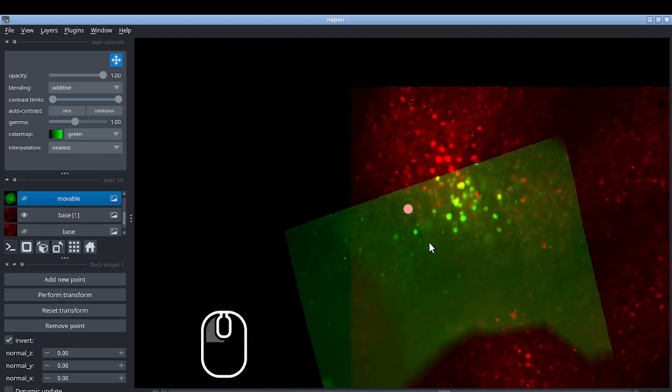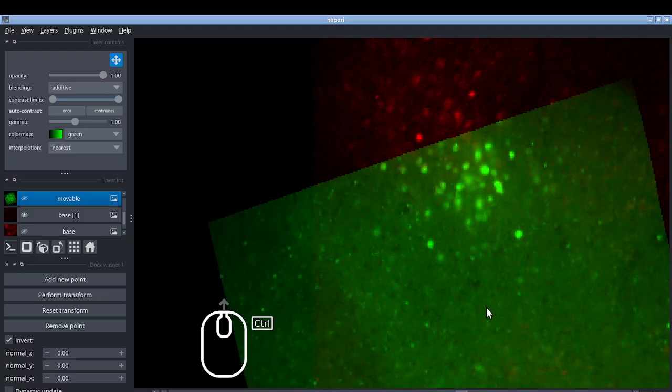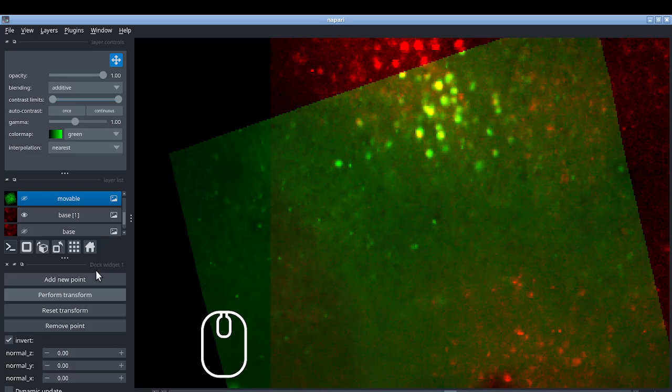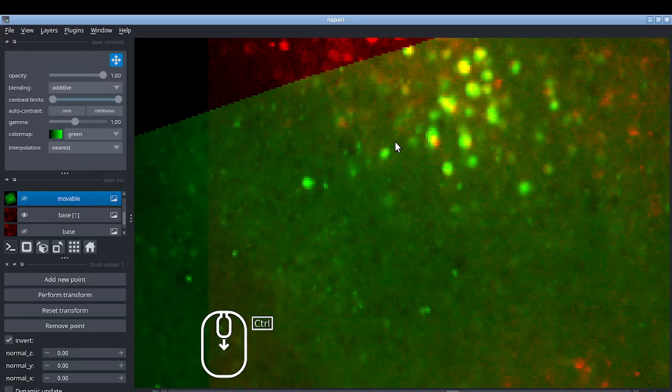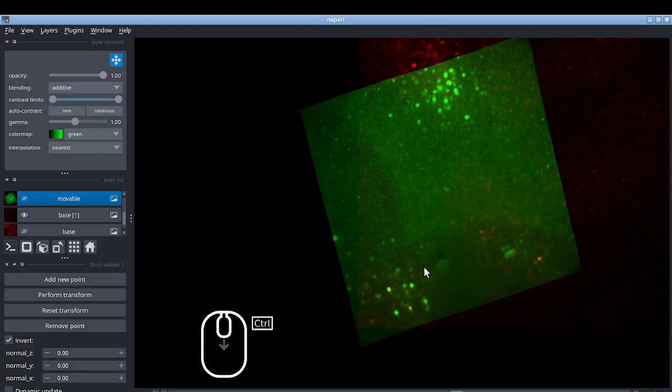Yeah, I mean, now we're just getting to these tiny refinements. And this is already good enough to work for in vivo to ex vivo cell matching. But we might as well, if we see it, just fix it. Okay, that's better. So that looks fine. What about down here?